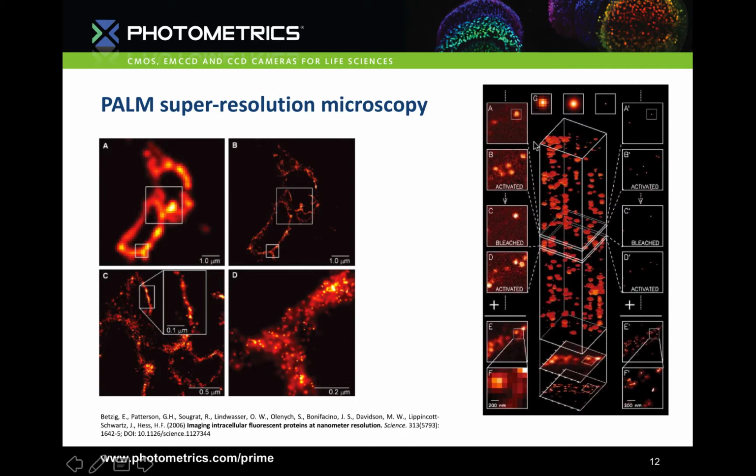Following activation, a readout laser of a longer wavelength is used to excite the photoactivated fluorescent proteins and detect their positions. The subset of fluorescent proteins activated by the activation laser is low enough that the proteins are far enough apart to be individually localized. This frame of data is saved and the fluorescent proteins are left to photobleach until no photoactivated fluorescent proteins remain.